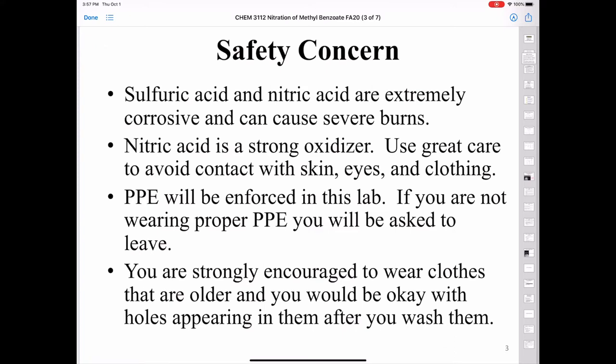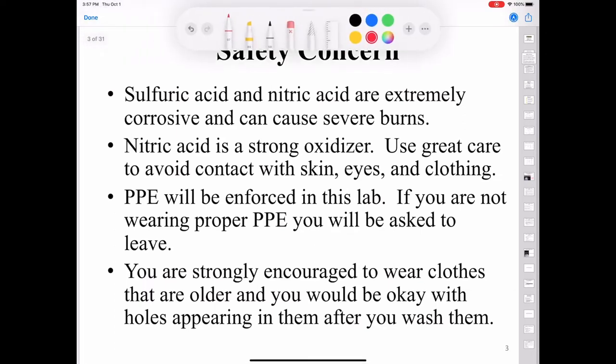Before we do anything else, we need to talk about the safety concerns in this lab. We're using sulfuric acid and nitric acid, which are very corrosive and very dangerous — they can cause severe burns. Nitric acid is a strong oxidizer, and you'll want to use great care when handling it. We want to wear gloves and all PPE, safety goggles, and we are going to be enforcing PPE to the utmost in this lab because you do not want to be burned by acid.